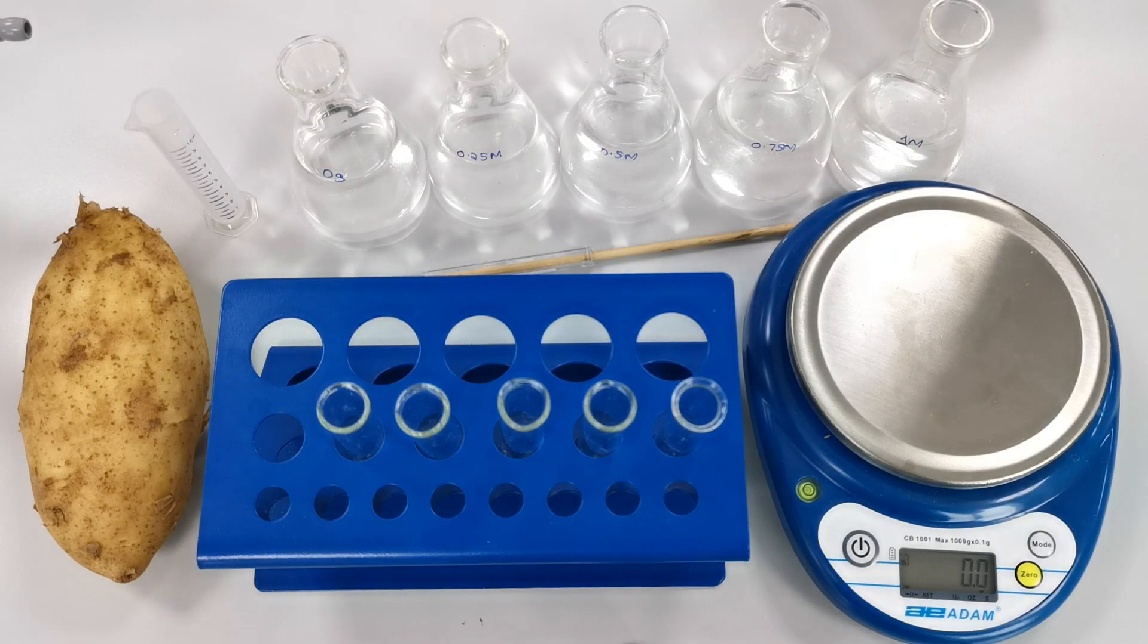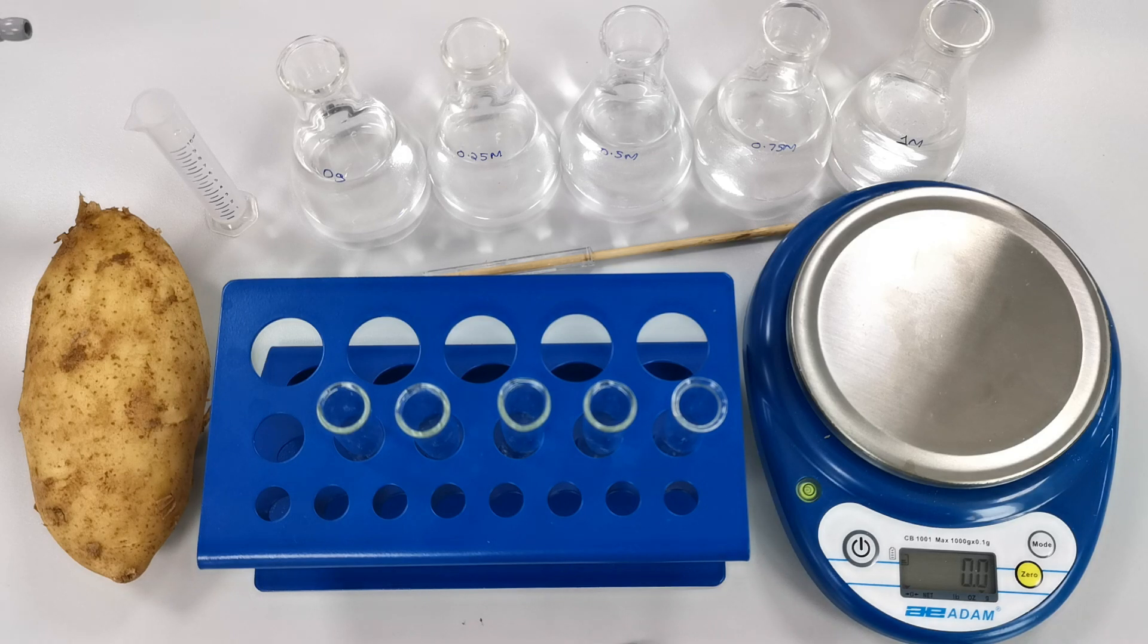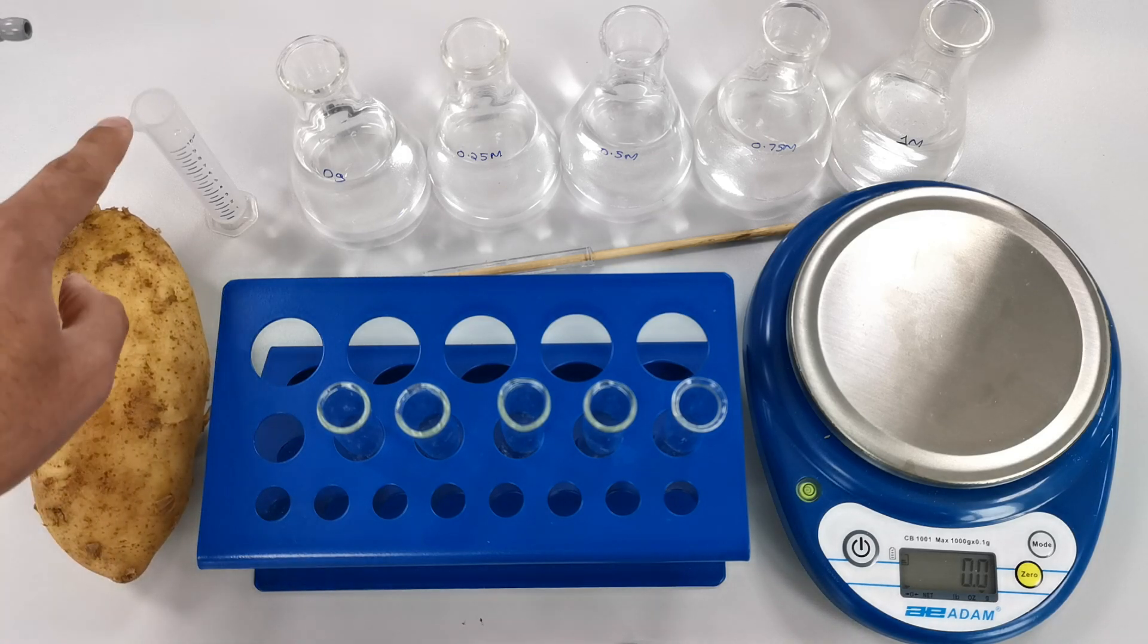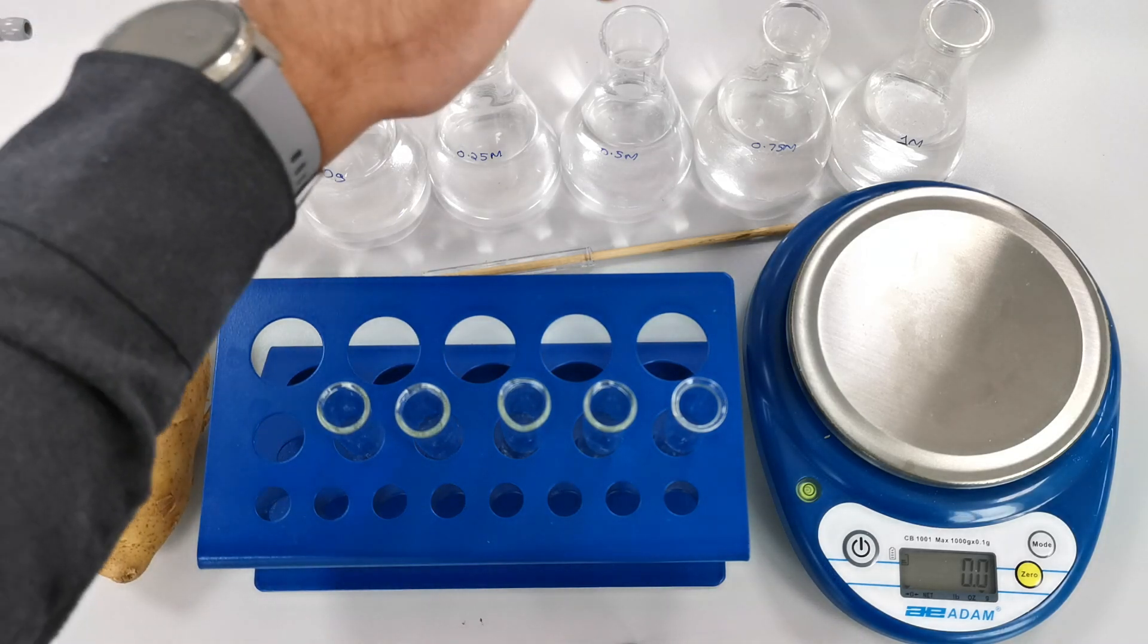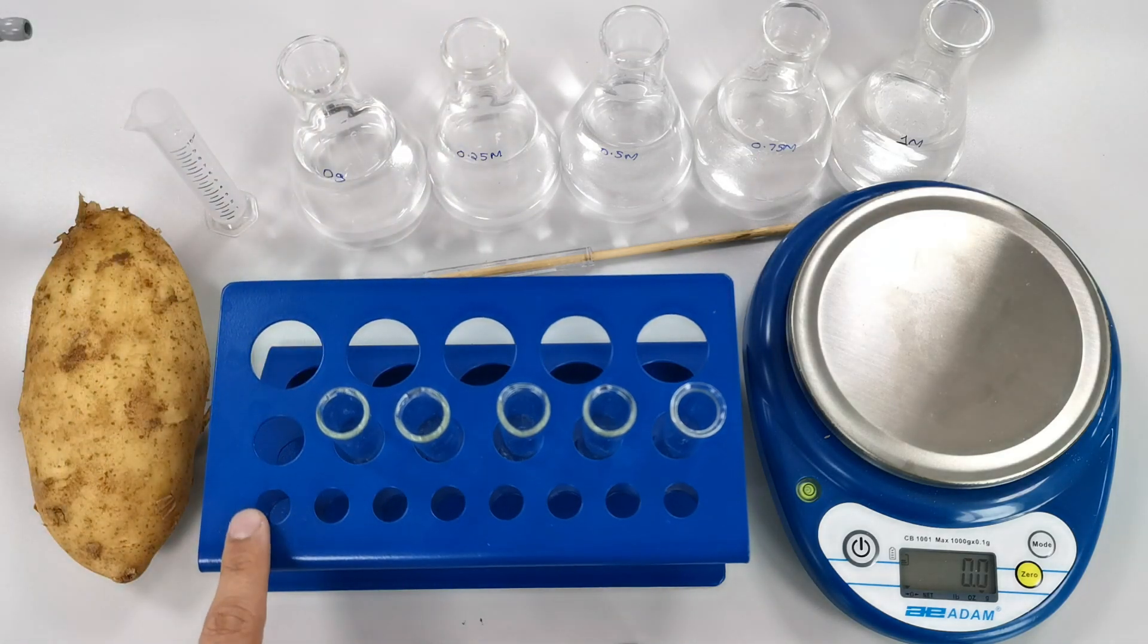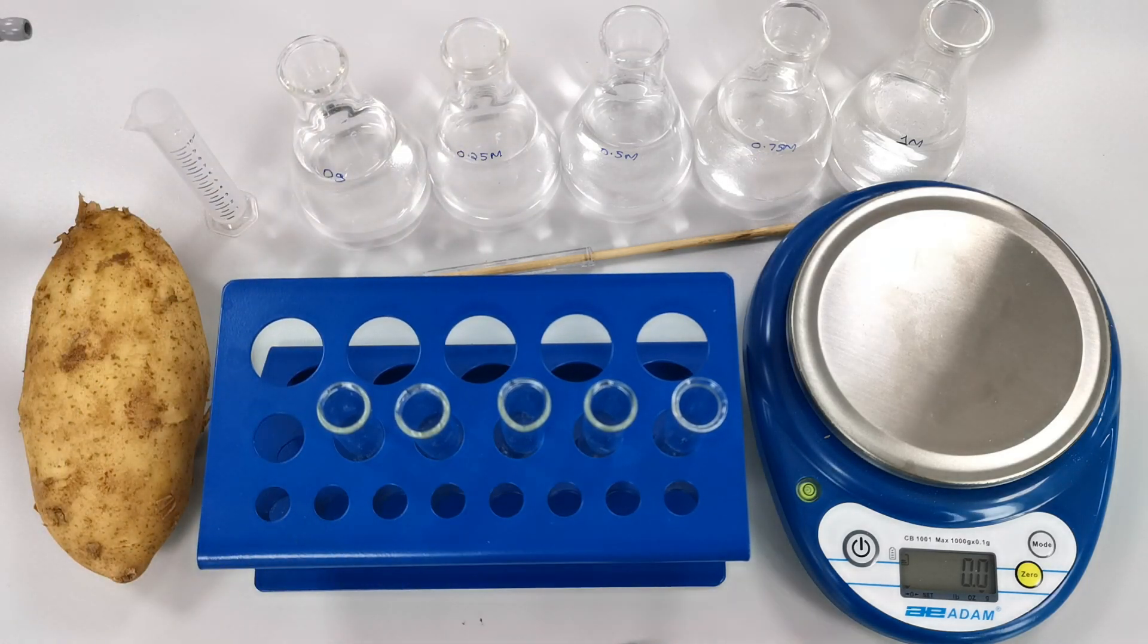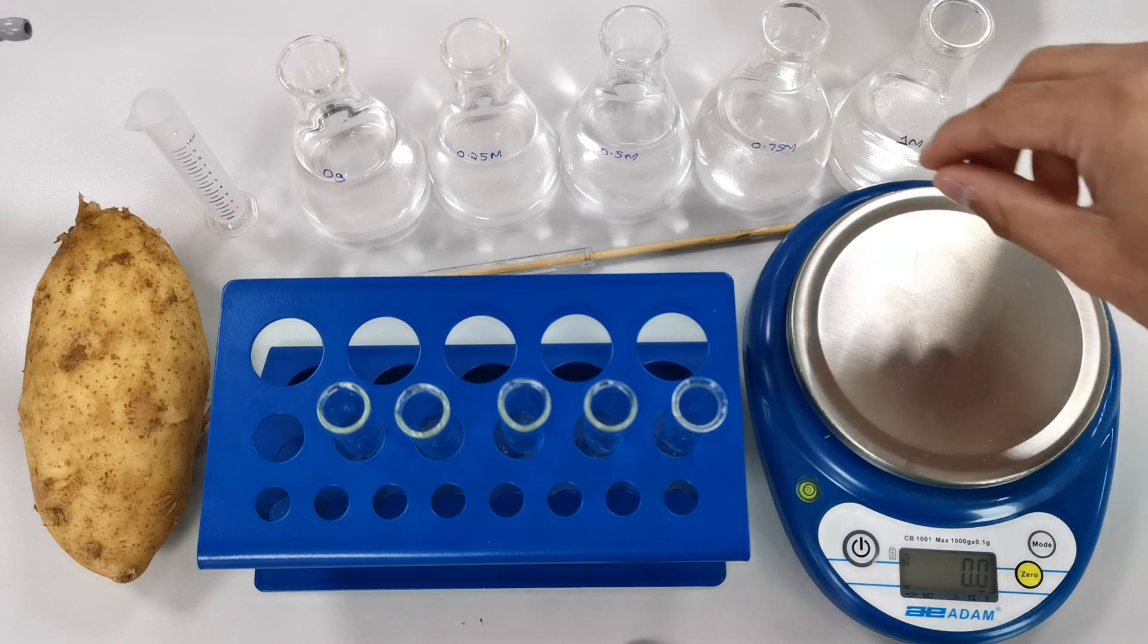This is the equipment you're going to need to complete the osmosis practical with potato cylinders. You're going to need a potato, a measuring cylinder, five concentrations of sucrose solution, a test tube rack, five test tubes, a mass balance, and a cork borer.